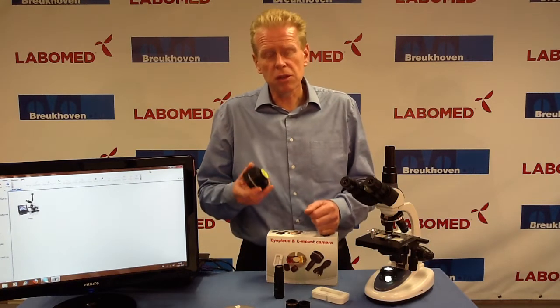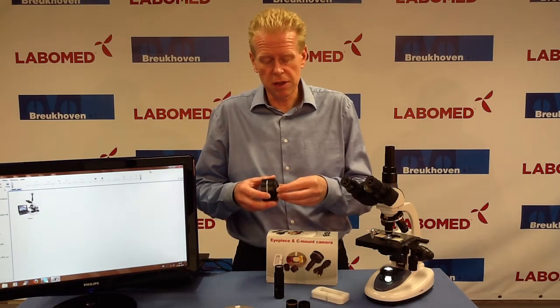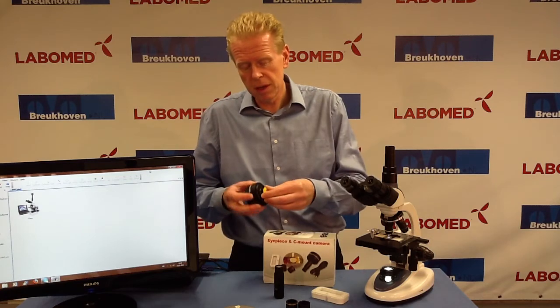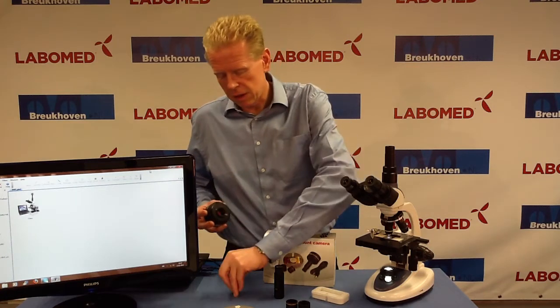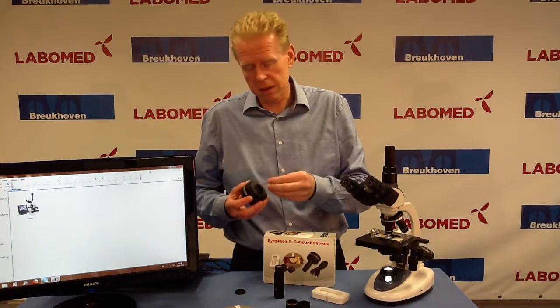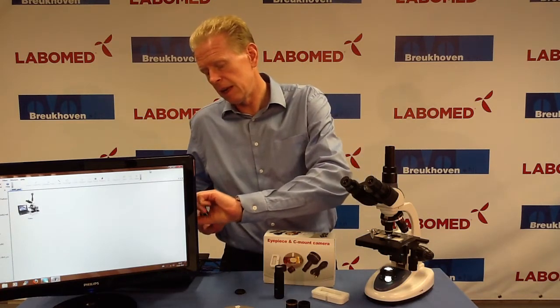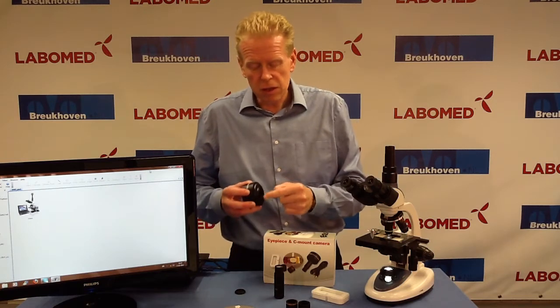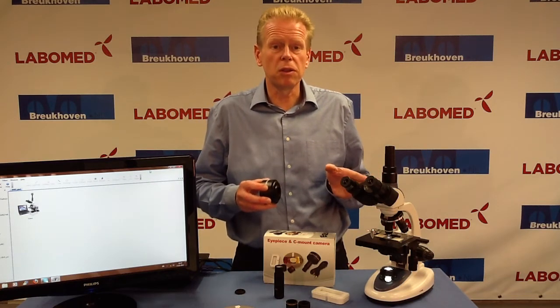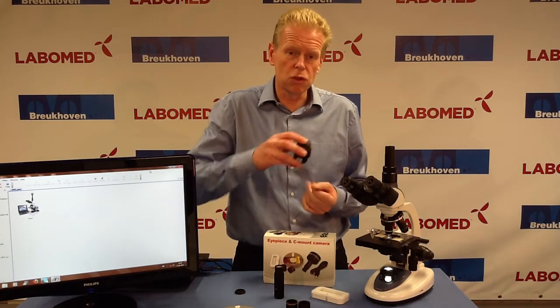All the cameras look the same; only the element inside will change. So I have here a 3 megapixel version. I will just take out the cover. In here you will find a little sticker to protect the lens inside from dust. This thread that you see here is a C-mount, so in case your microscope has C-mount compensation optics, you can screw it on directly.